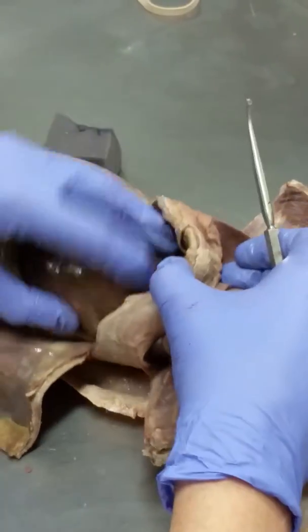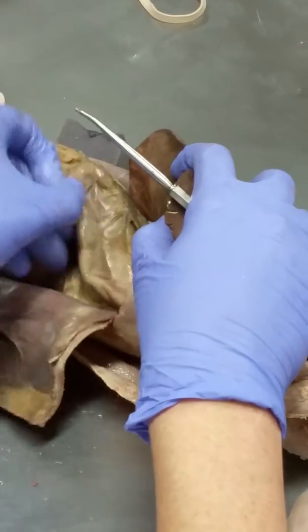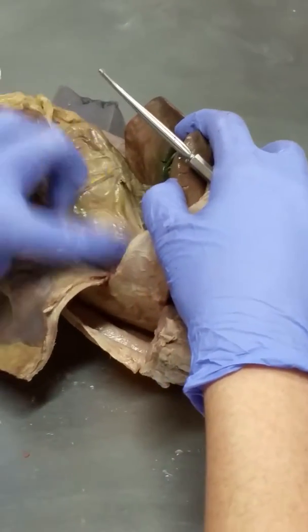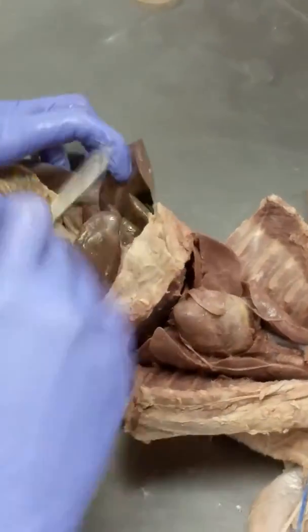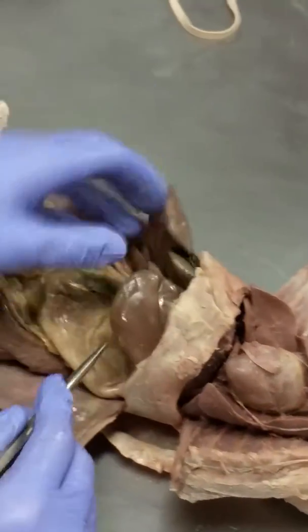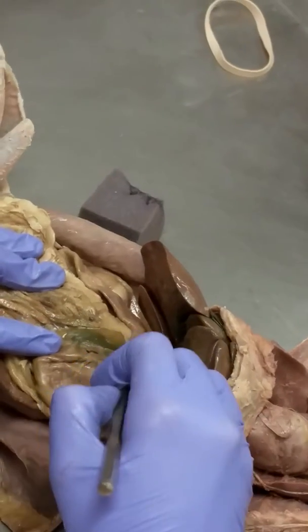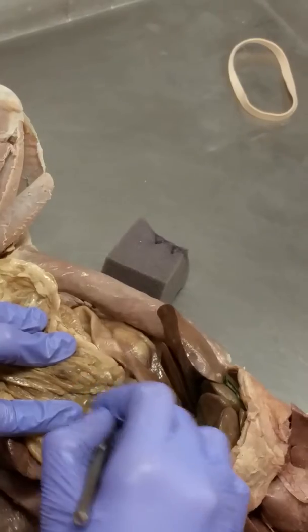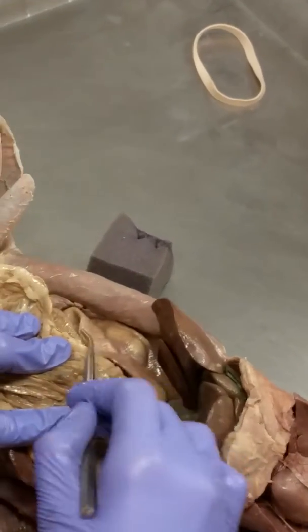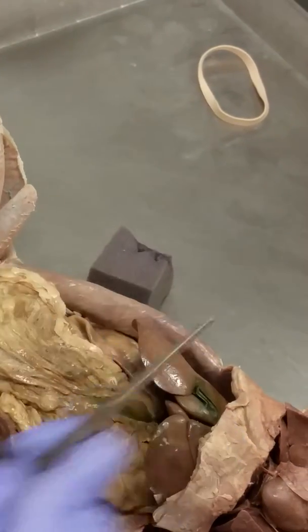So all of this right here, this is all liver, right? And underneath of the liver is the stomach. So this is stomach here. And then stomach is going to, sorry, the liver's just in the way of whoever's on the other side. The stomach is going to curve around, and there's this little curve right there. This part coming down off of that curve is duodenum. So here's duodenum right here. And duodenum just goes straight down.